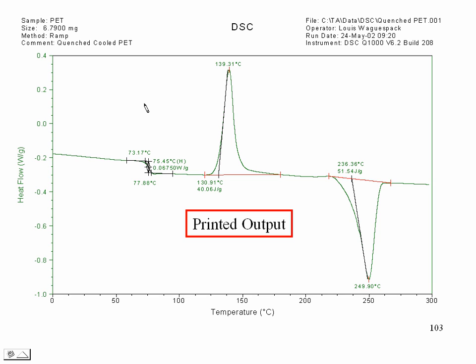Now the way this looks is going to be controlled by some options, which I'm going to get to in a minute as soon as we talk about customizing. So all this information up here that gets displayed, that can be controlled in main options.